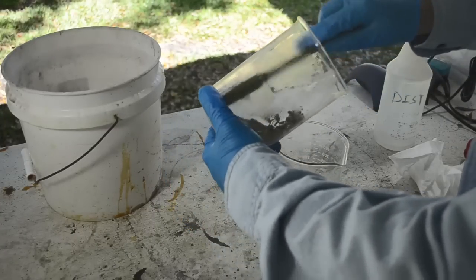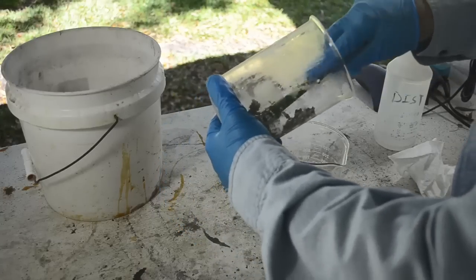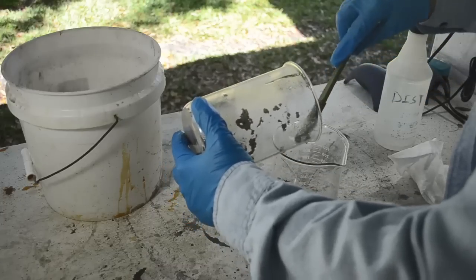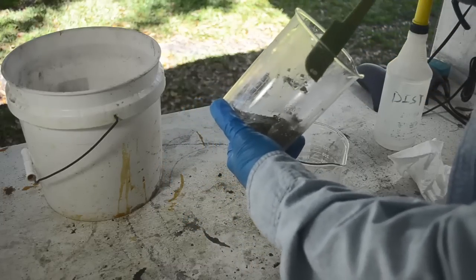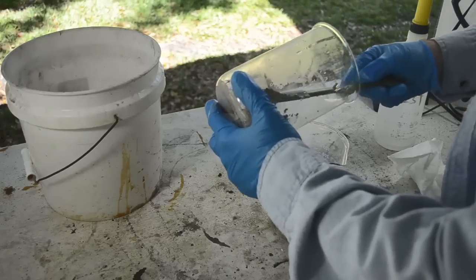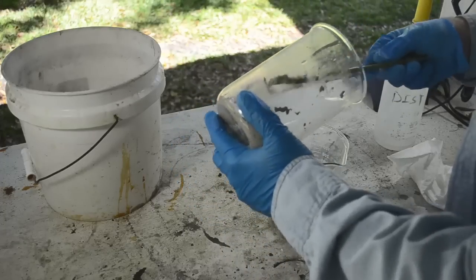I just need enough for a comparison, okay? So what I'm going to do is boil one in hydrochloric acid and one in dilute sulfuric acid. Rinse the acids out. Again, more rinsing.